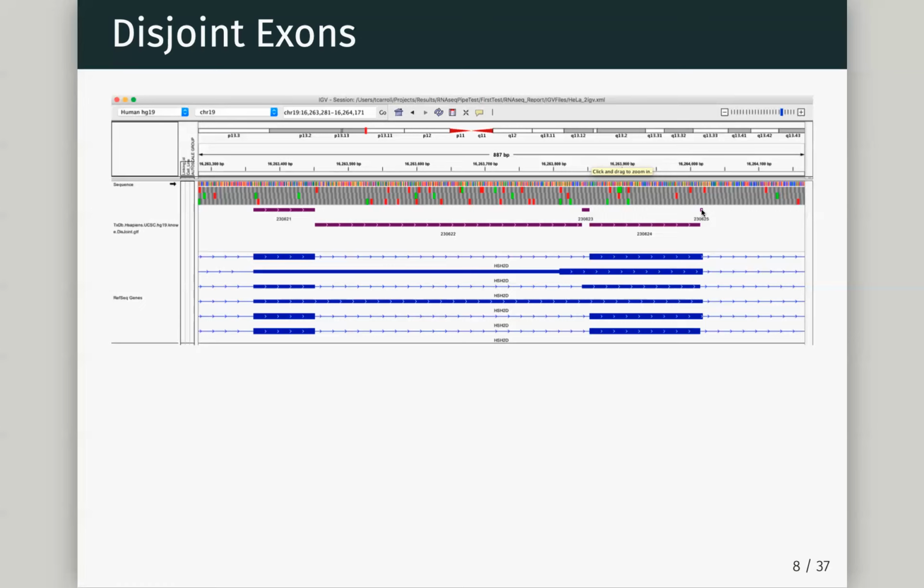Okay, so we're not doing anything computational yet, but you could imagine if I saw an increase in expression over this middle exon, very simply, I would say this transcript or this transcript must be going up, right? If I see more signal over this intron, this retained exon, it could belong to no other transcripts, right? It needs to belong to something which had an exon retention over the intron.